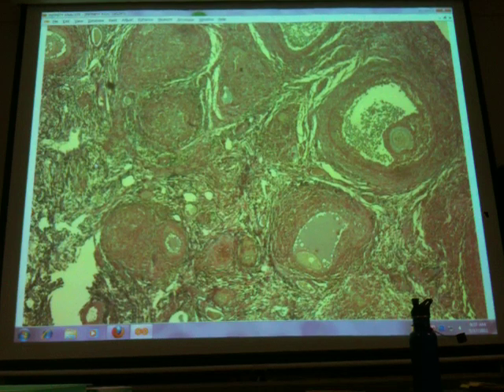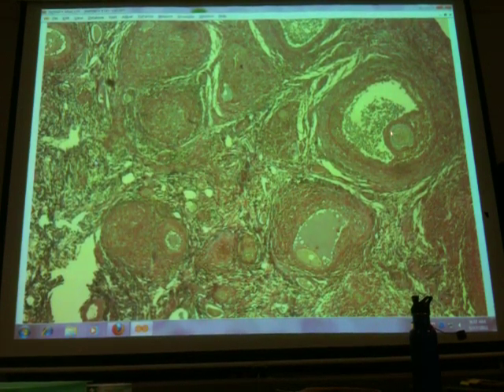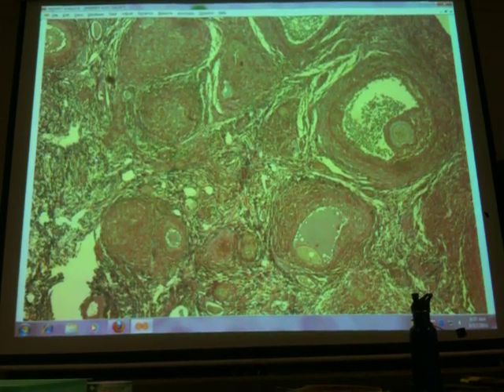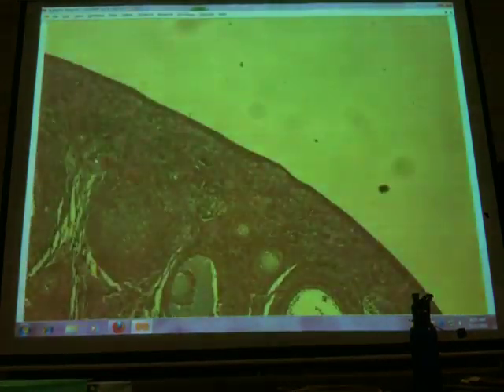The oocyte that's still undergoing meiosis is this right here in the middle. Okay? And you'll see that sometimes our section has intercepted the oocyte.